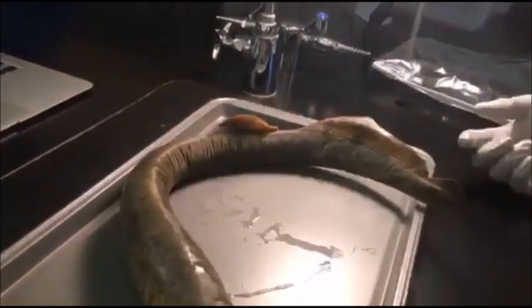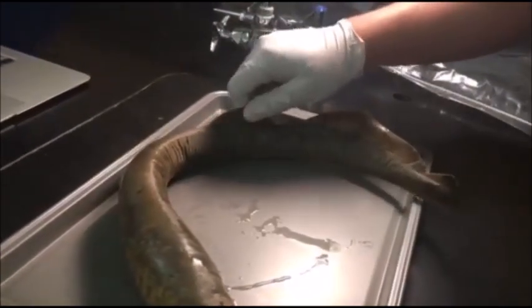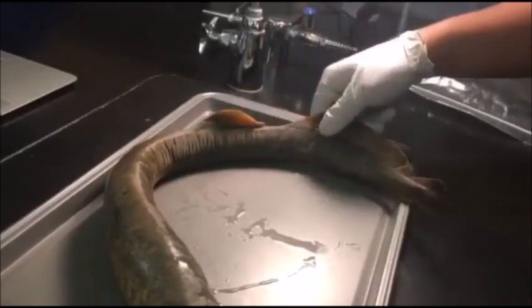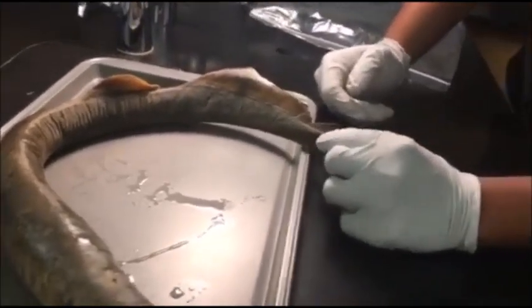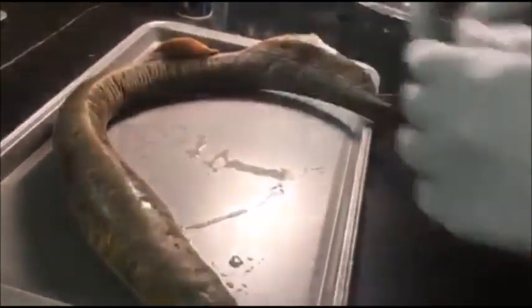To help him swim, there's the anterior dorsal fin, which is a little bit towards the middle of his body. And then there's the posterior dorsal fin, which is at the end of his body. And then there's the caudal fin, which is at the very end of his body.